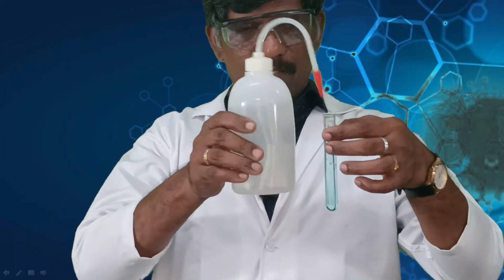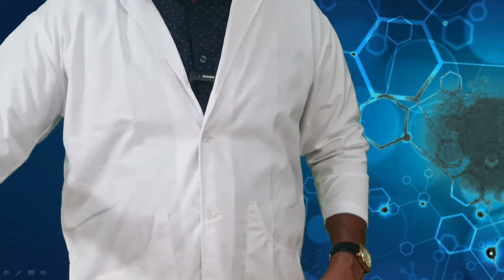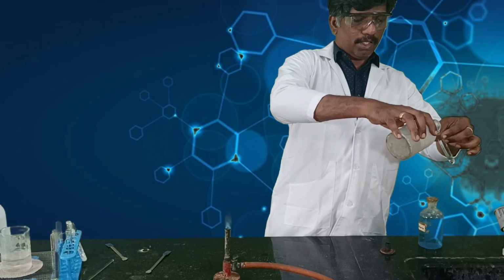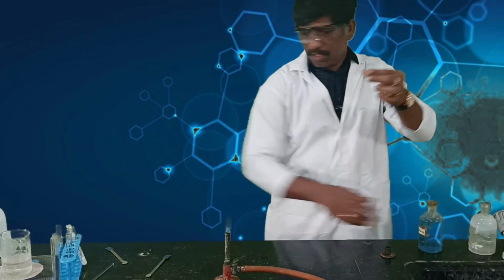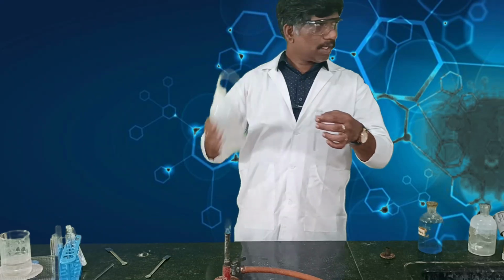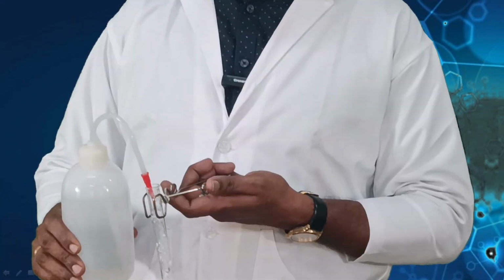The dilute solution of copper sulfate will give proper color. The NaOH also I can take dilute. Take a little amount of NaOH and dilute it.